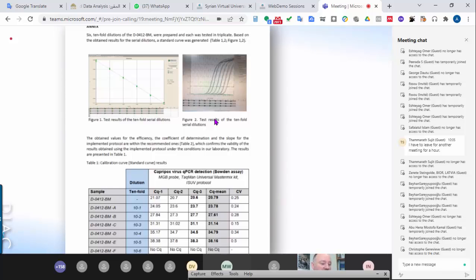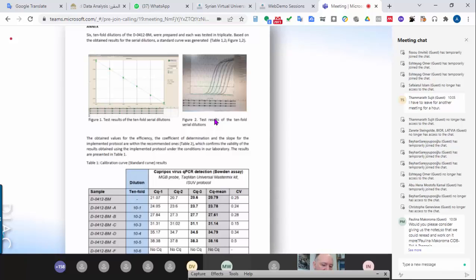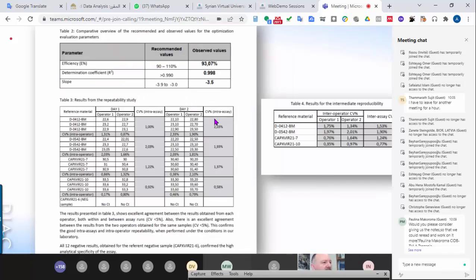As we previously said in our presentation, you can use this as well, and you can say that 38.16, for example, because this is the mean value, would be your cutoff point. But you will see later on that around this point you should determine the measurement of uncertainty to be able to put the doubtful zone as well for your final interpretation.